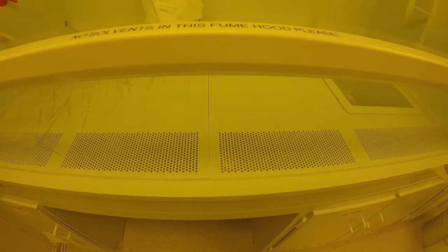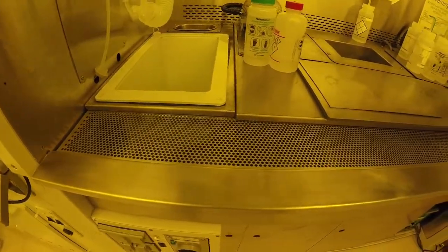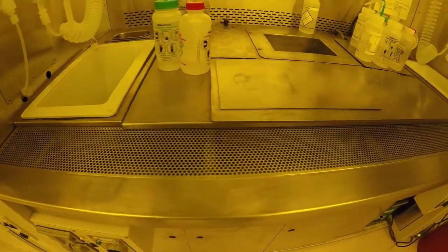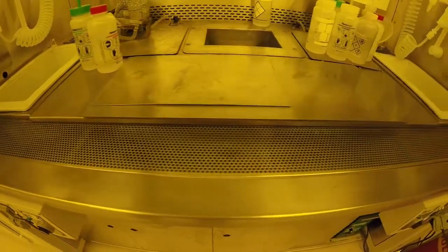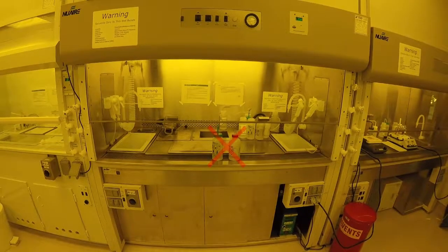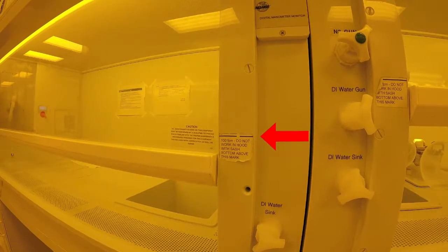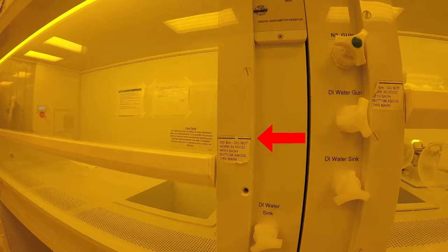Our hoods protect users from chemical fumes by forming a vertical, laminar flow of air that covers the sash opening. If any area of the vents are covered, your protection will be compromised. Never cover the vent holes with clean room cloths or chemical bottles. For the hood to function correctly, the sash must be lowered to the appropriate level as marked.